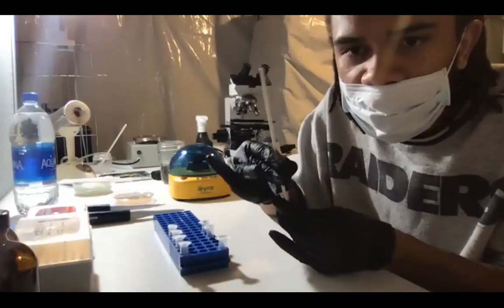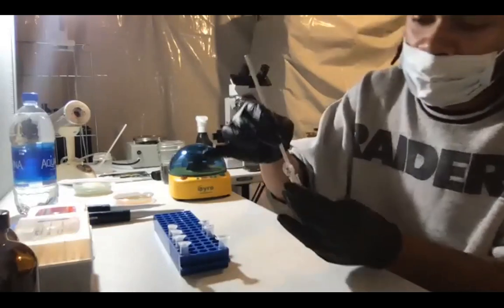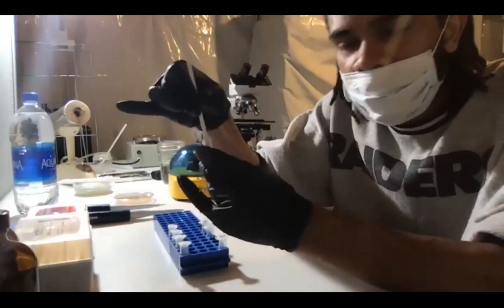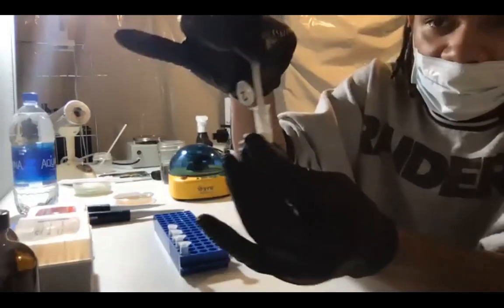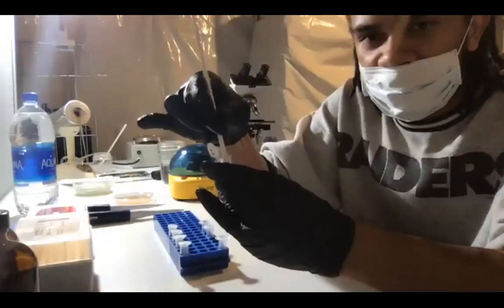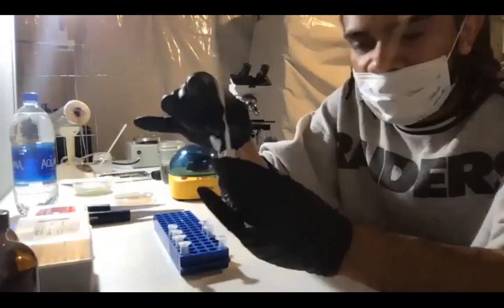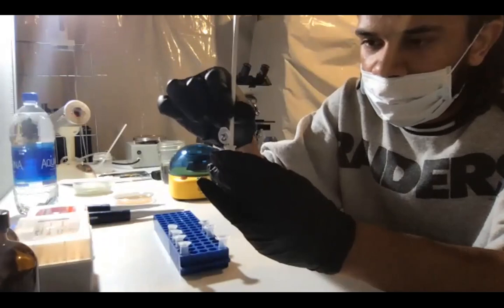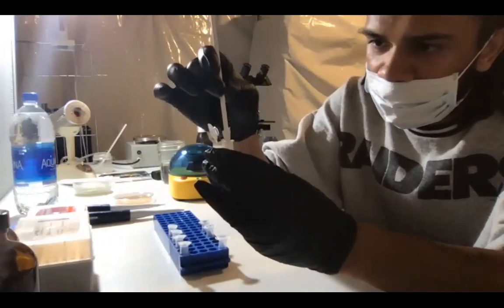What are you grinding into the extraction liquid, somebody says. The little piece of mycelium that I put into this tube, I'm grinding it up and mashing it up. And what happens is the cells will break open into the extraction liquid and then the DNA will be in the liquid.